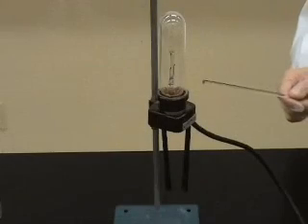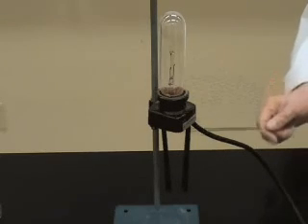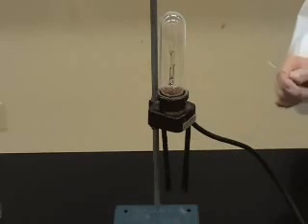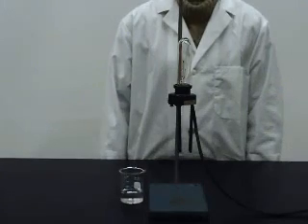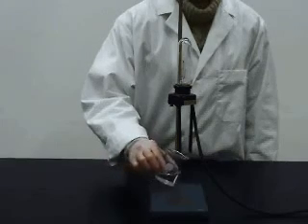This is the conductivity tester. When an electric current passes between the terminals, the circuit will be complete and the light bulb will glow. The solutions that we will be testing are aqueous solutions, so we should first test the conductivity of pure distilled water as a control.